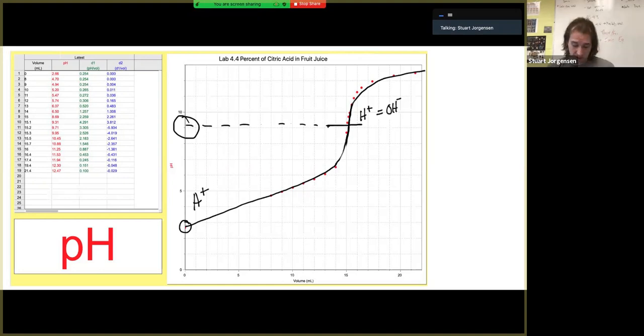Cool, now that we found the equivalence point, we can drop this back down to get a volume. And now we've got the point we need, because we know 2 very important things. We know that at the point where all of the acid was neutralized and we had equal parts acid and base, looking at our graph, that point down here looks like approximately, that's 15, that's 16, so 15.2 based on the graph. I got 15.2 milliliters based on the graph.